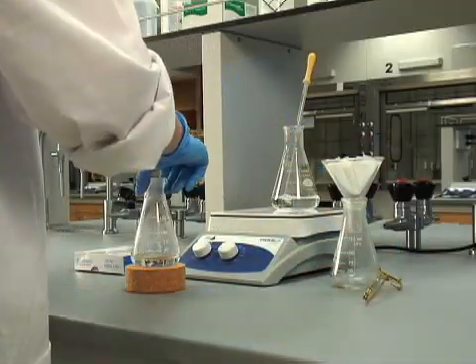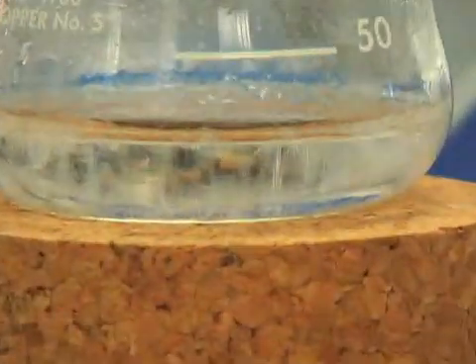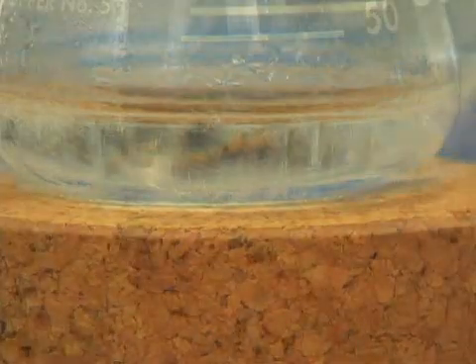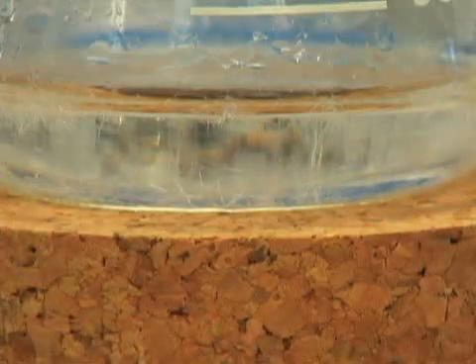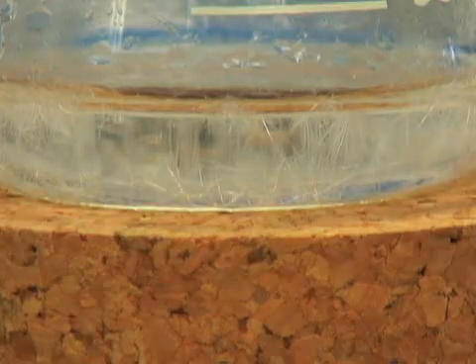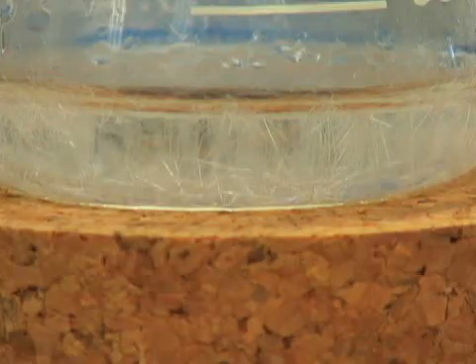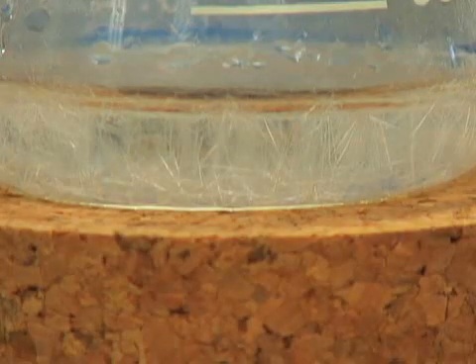Remove the flask with the filtered solution from the heat and allow it to cool slowly. Although the formation of crystals takes some time, we've sped up the footage to demonstrate the process. While the crystals form, the soluble impurities remain in solution.